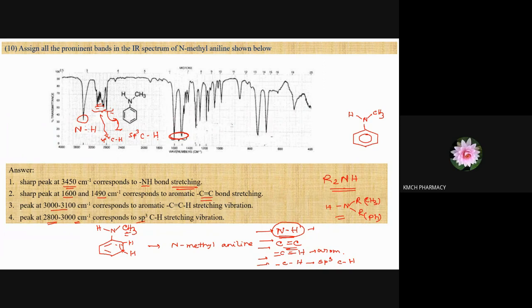And that higher frequency value of around 3000 plus is coming due to what, sir? You mean polystyrene? You mentioned there are two peaks appearing, one at around 1600, the other at 3062. The 3062 is due to the aromatic carbon-hydrogen stretch, sir.